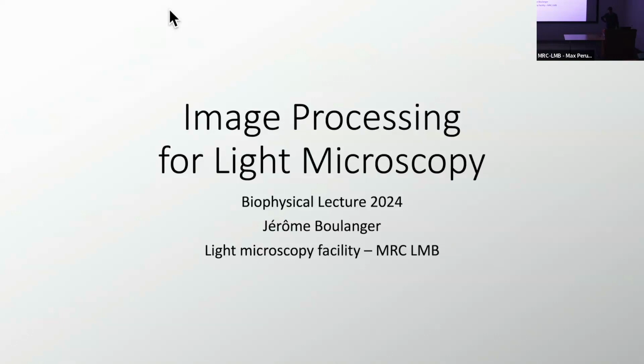I'm Jérôme Boulanger from the Light Microscopy Facility. I will talk about image processing for light microscopy. What I will talk about will not directly apply to electron microscopy, but there is some overlap. Obviously the workflows are very different, and the problems as well.